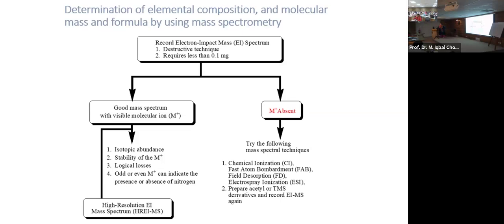It's just a waste of time, effort and money, because if something is not completely soluble, you cannot get a good result out of it. Maybe partial solubility gives you some peaks, but you need to find the correct solvent first, so that your compound is soluble. We are using solution NMR, we are not using solid state NMR.